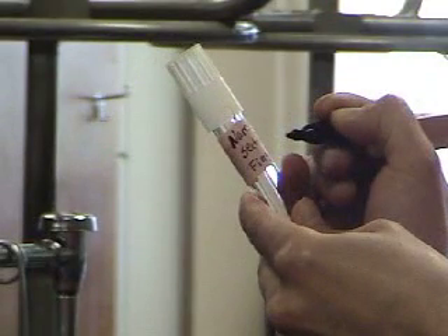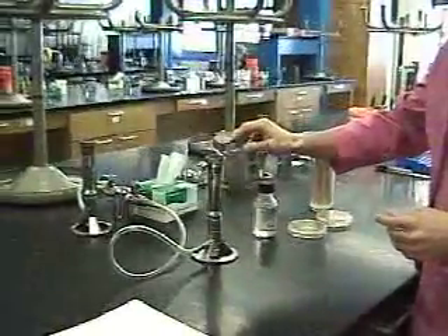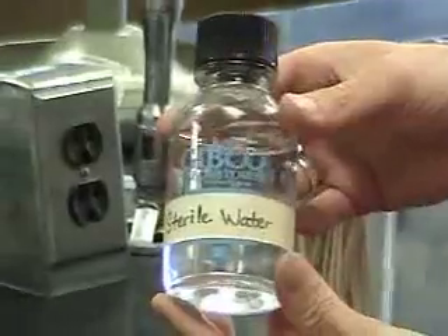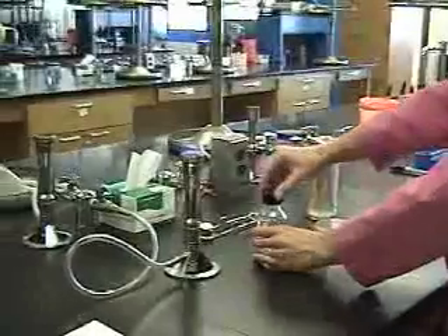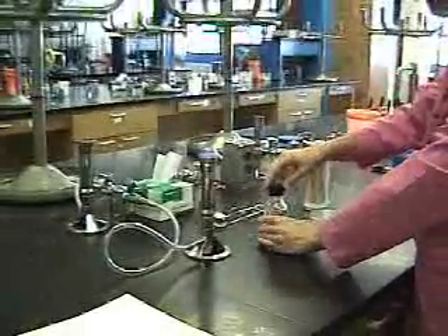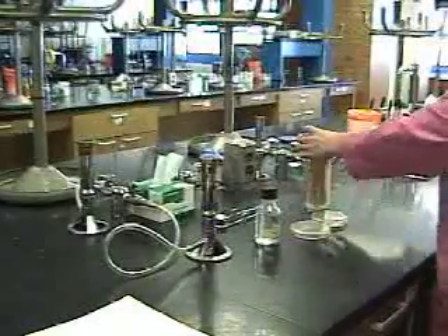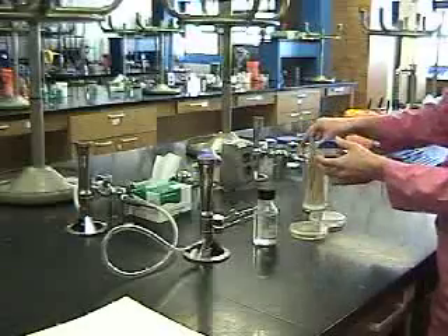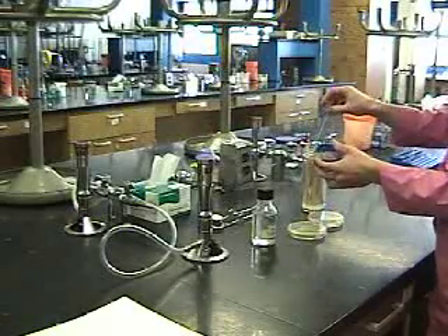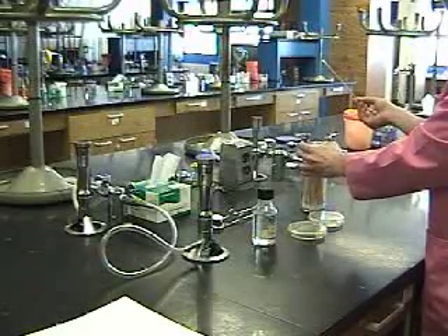Now we're ready for the fun part. We get to use fire to help us maintain sterility. Light your Bunsen burner with your striker and open your sterile water. Make sure that the lid is loose before you try to manipulate any of your jars using only one hand. Remove a sterile swab from the bottle.